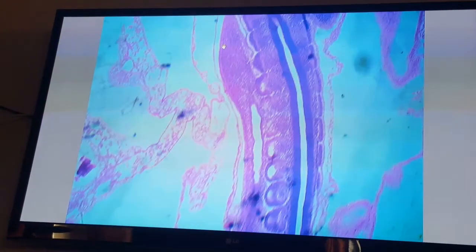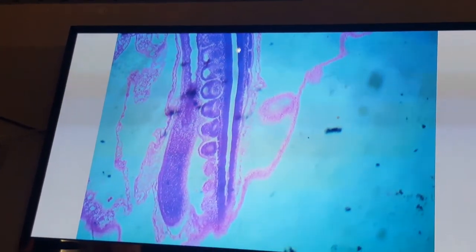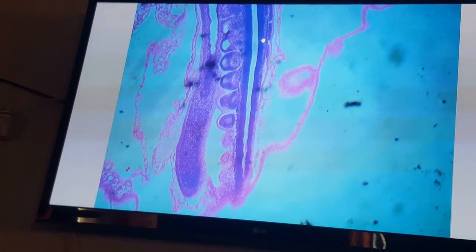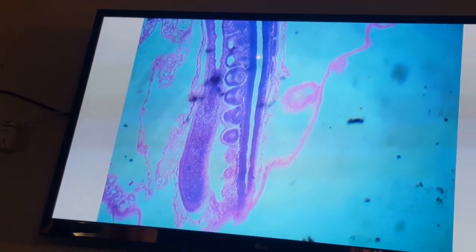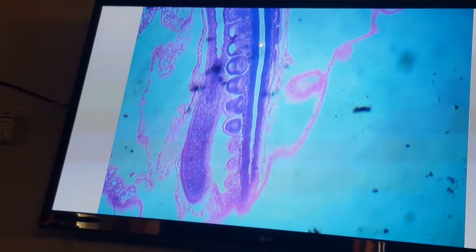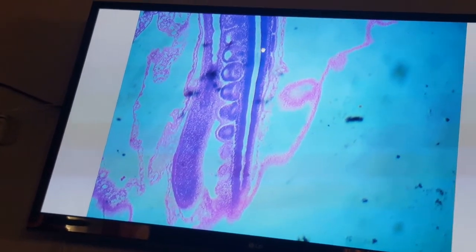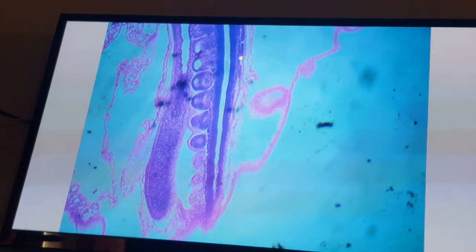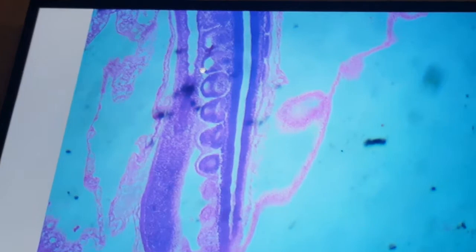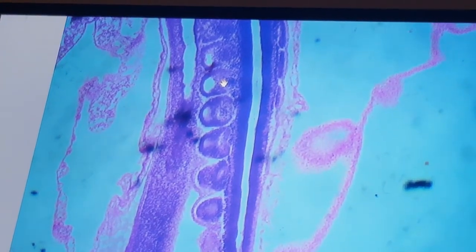Caudally, you may look to the neural tube that remains cylindrical and it will form the spinal cord. The cavity of this cylindrical spinal cord will be the central canal of the spinal cord. Just look to the dermomyotome and sclerotome on that side and that side. This is the dermomyotome and sclerotome as it appears in the sagittal section.